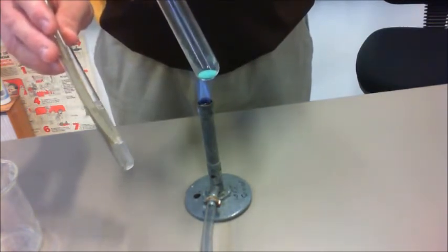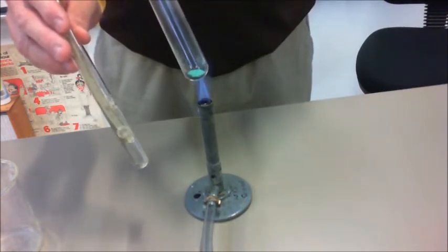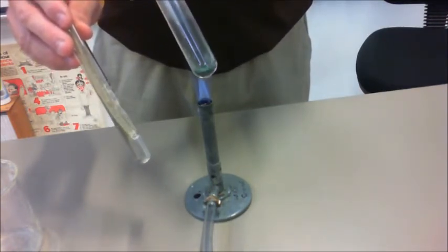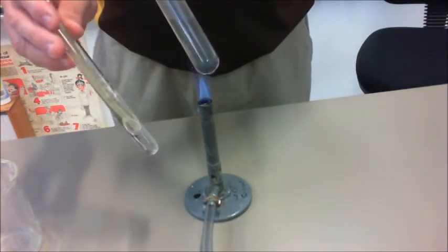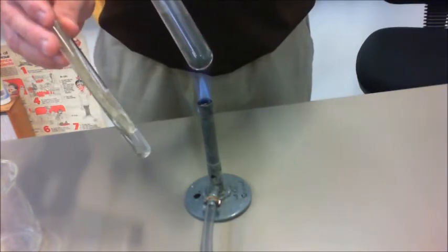Now, you can see straight away in there that it's starting to bubble, so that means that it's starting to produce gas. And also, you can see the copper carbonate is turning black inside the test tube.